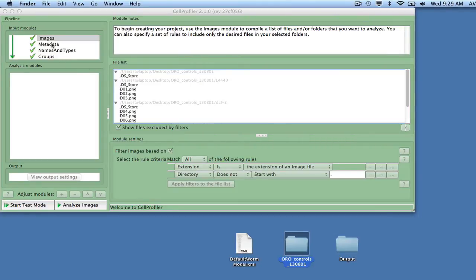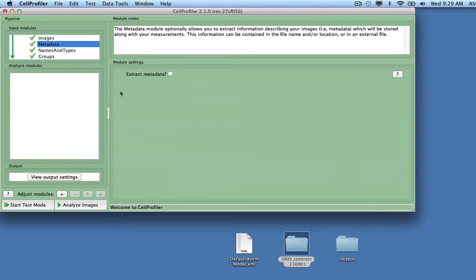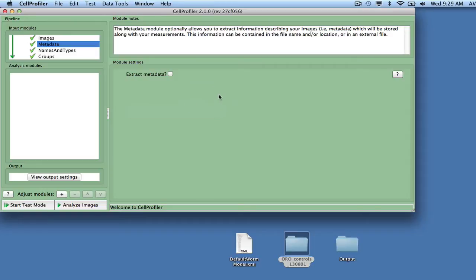The input module metadata enables extraction of metadata information from the image file names and folders. Click on metadata in the list of input modules, and the module settings for the metadata module will appear on the right.